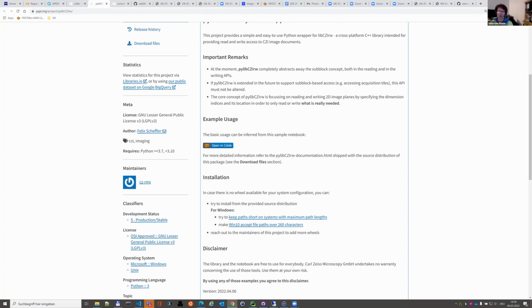Also on ImageSC, what is your use case? What would you like to see? And I promise we will have a close look. We're probably not going to do everything, but let's see.